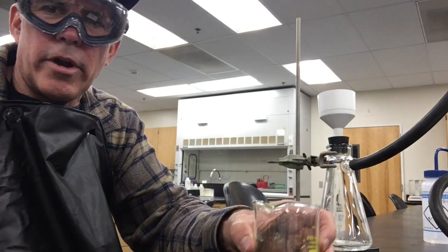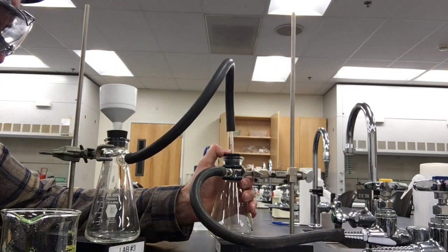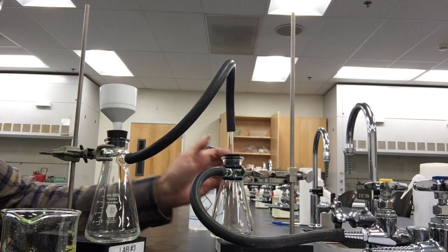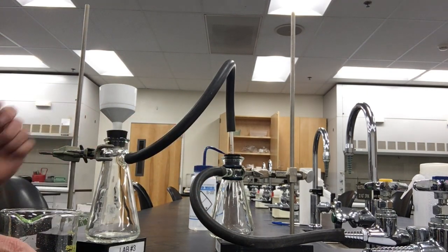So what I've set up is a safety trap. Any solution that gets sucked through this hose — probably not much will — it's going to go into the trap.